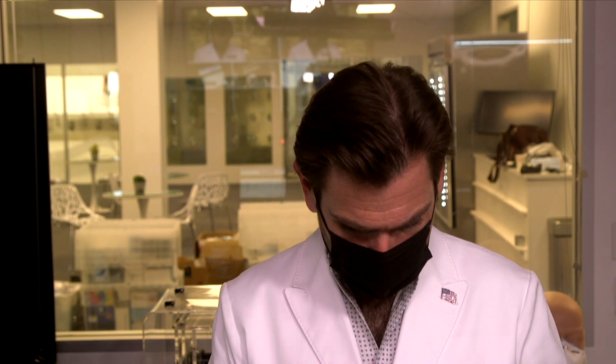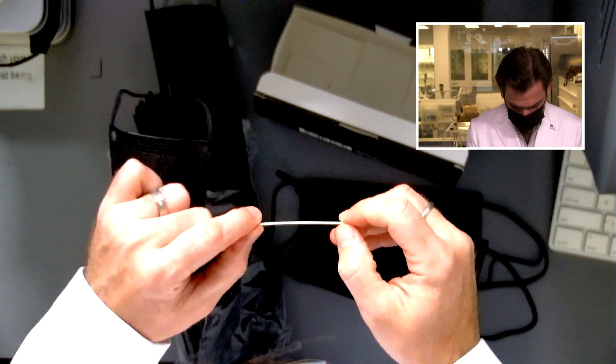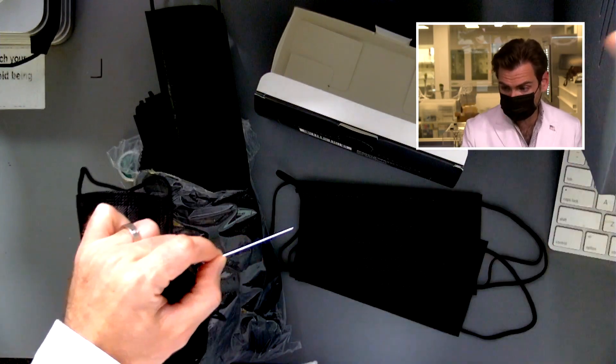Wow, this would fit on really — oh my gosh. Scissors, scalpel. I almost got my finger right there, I've got to be way more careful. This is a plastic nose wire — these are horrible. I can tell as soon as I put it on my face.